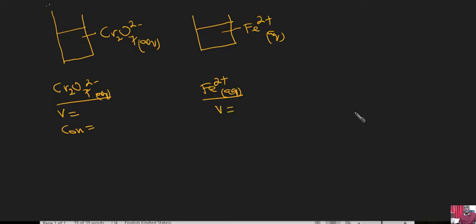The pipette we had was 25 centimeters cubed, and that is what we pipetted. That is 25.0 centimeters cubed.